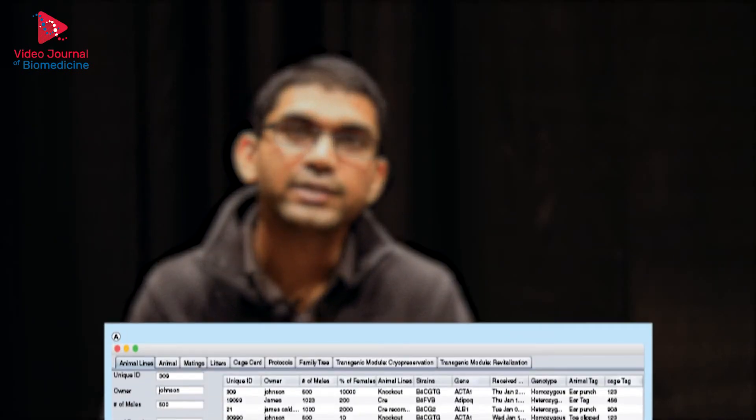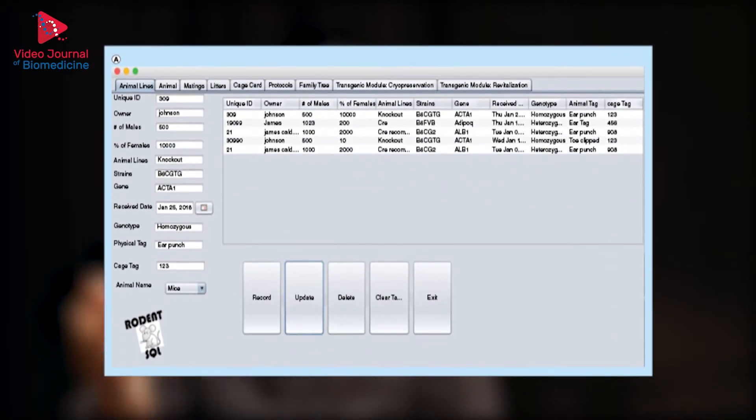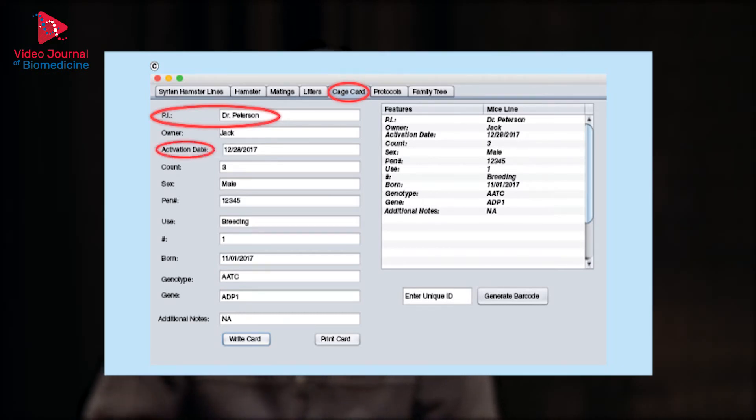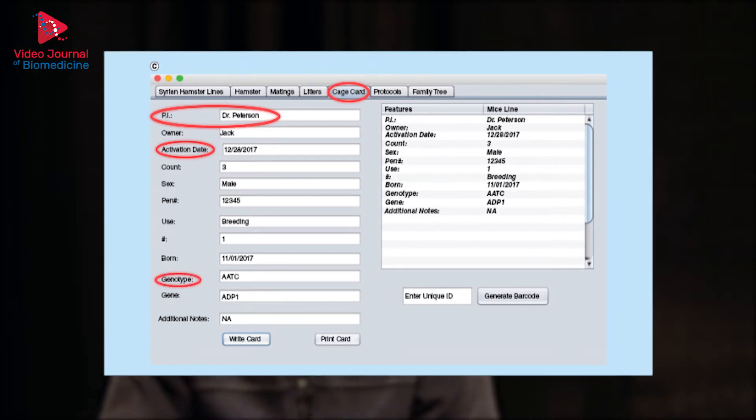Apart from mating, you also need to note individual IDs, genealogy which is the pedigree chart for your mice, cage cards, the investigator performing the experiment, the date conducted, and other important features like genotype, phenotype, count of mice, and sex of mice. All of this information can be stored in one setting in our software interface and saved to a back-end SQL database for retrieval.